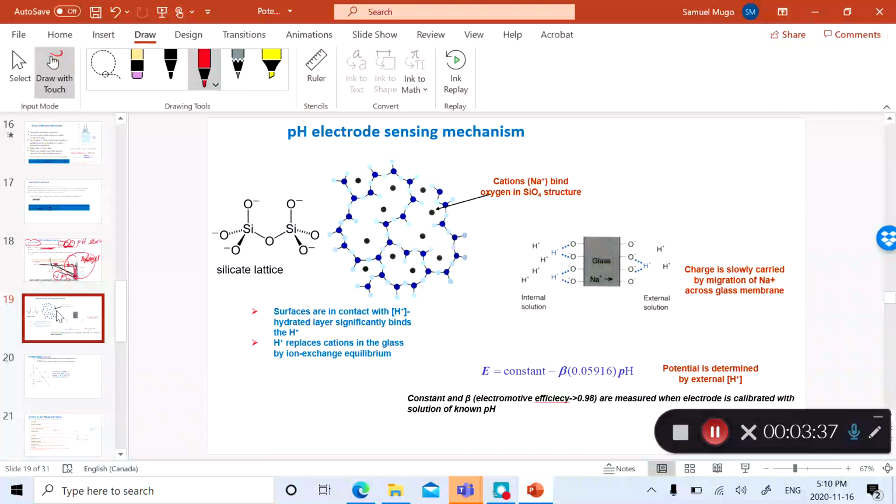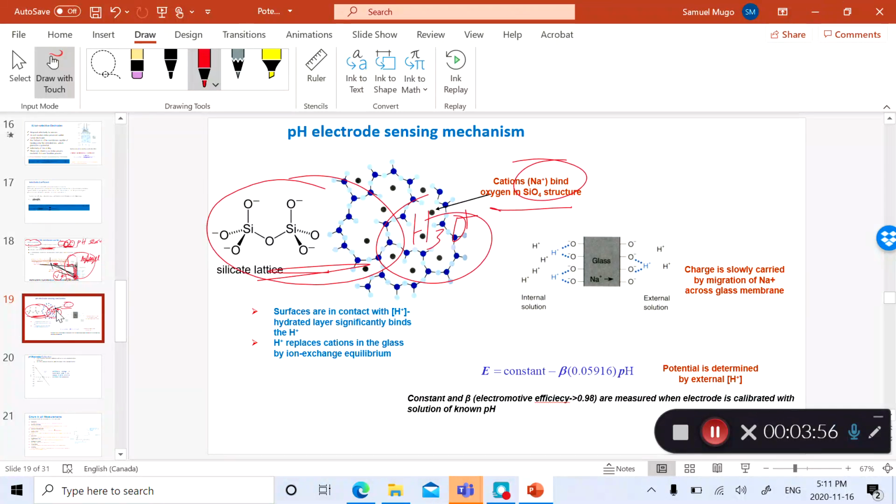I think most of us know glass is made of what you call a siloxane polymer, an inorganic siloxane crystal, which looks like this. And like I said, it's fairly selective to hydronium ion, although it also interferes with sodium ions at the same time. But remember, it's very important when you're using a pH electrode for it to be hydrated.